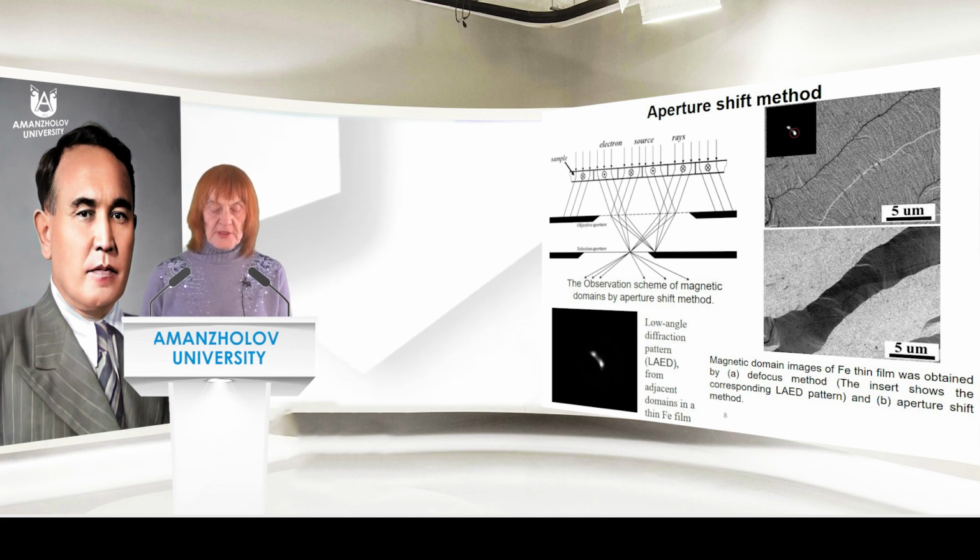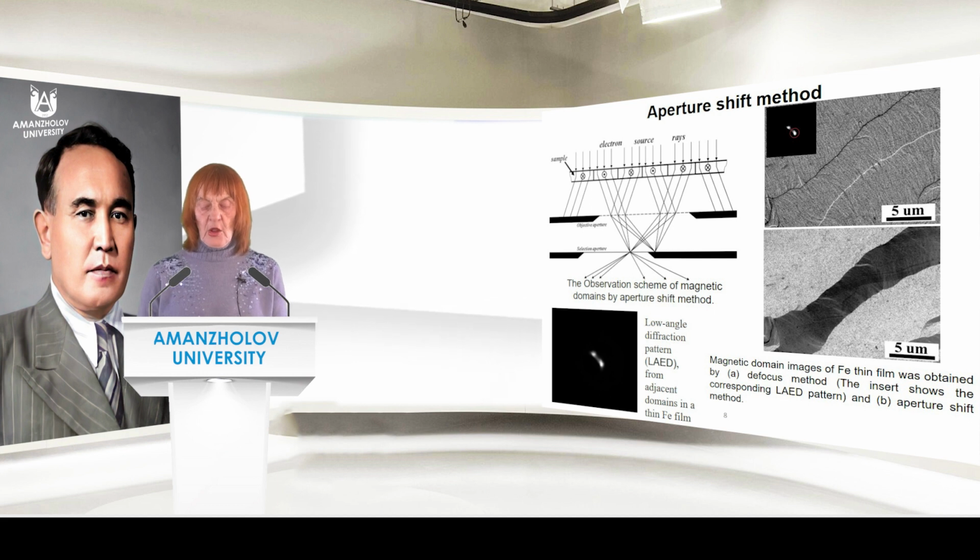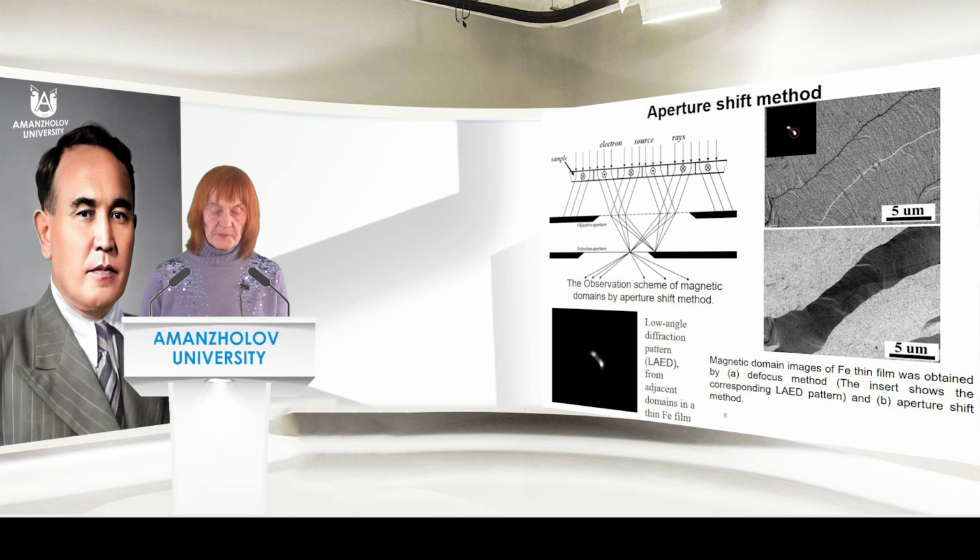The objective lens aperture is used to select the sample region which corresponds to the low-angle electron diffraction pattern.